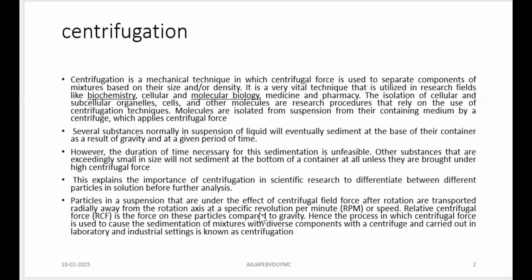So when we are talking about the process of centrifugation, the centrifugal force is used to help sediment the particles or suspended materials from the mixture. You have diverse components, different components in a given sample, and the particles will be settling as per their size, as per their density, at their own rate. They will be moving and settling down.